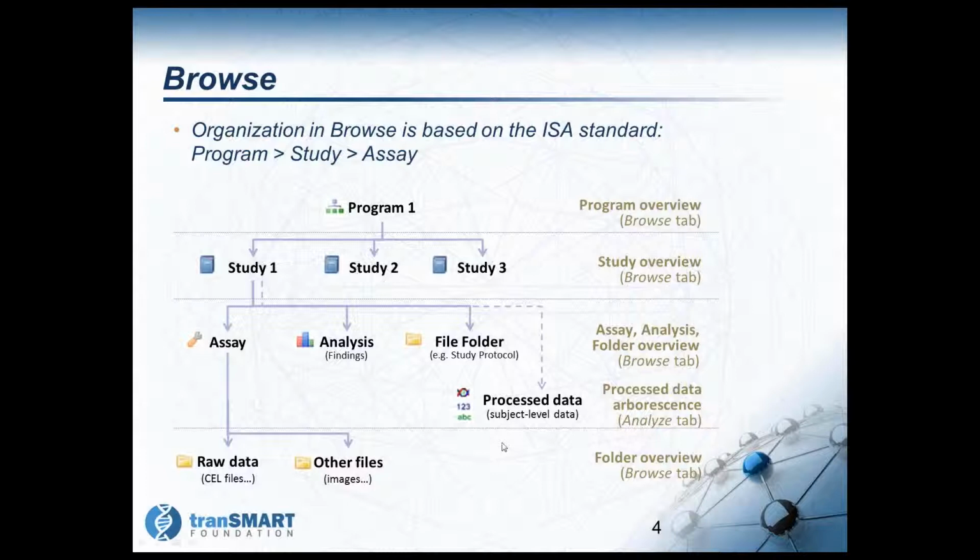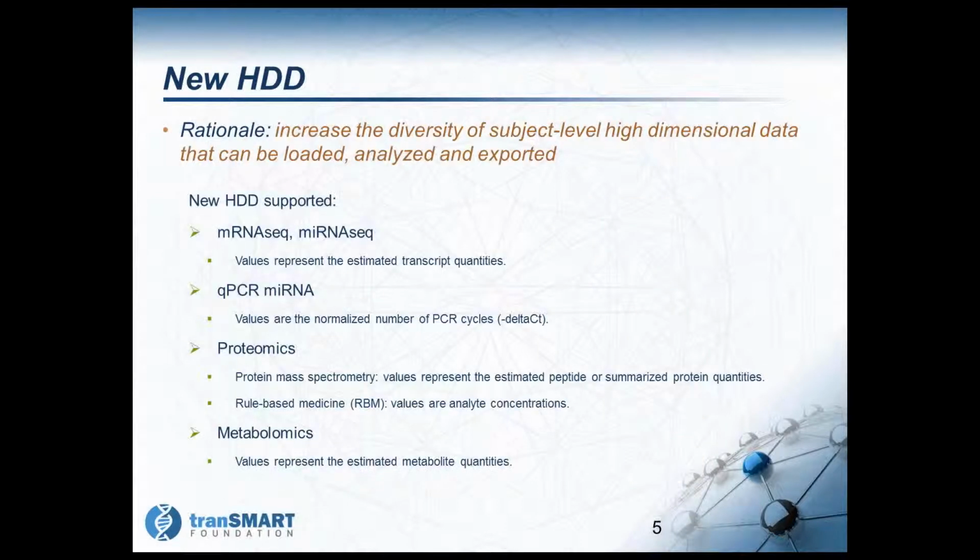So I will skip this slide to keep sufficient time for the demo, but this slide is just to tell you that we have implemented a new data organization model in order to structure our data and make sure that data sets are more easily searchable by our scientists. So this new data model is based on the ISA standard. So hopefully the demo will help you to better understand the different concepts that are shown on this slide.